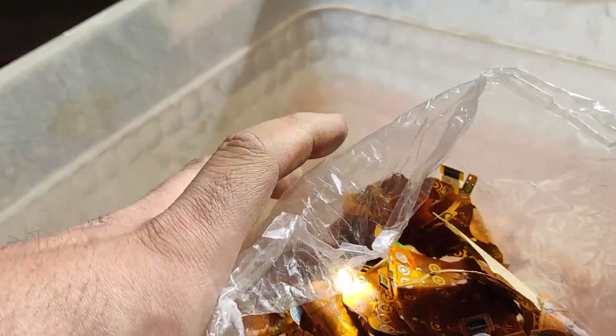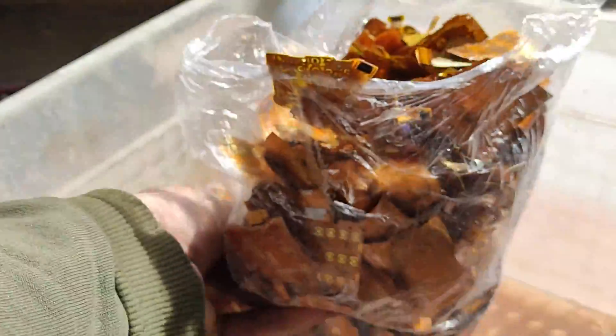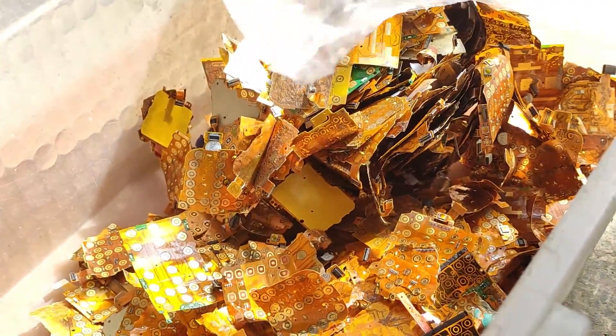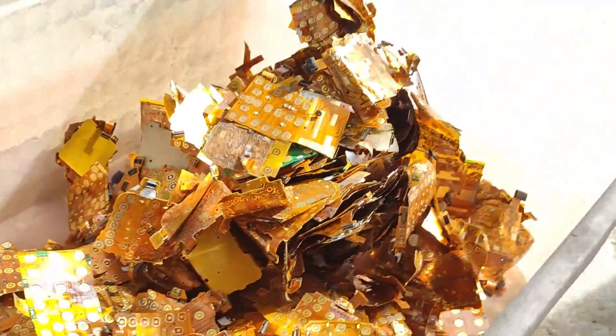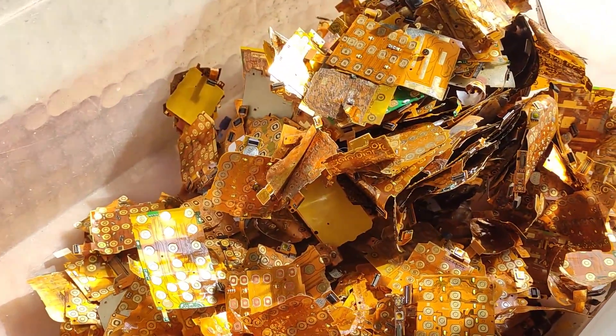Hello refining enthusiasts, today I will be working on extracting gold from cell phone flex touchpads. This material has consistently provided misleading data, prompting me to personally delve into the process to uncover the truth. I've gathered about half a kilogram of this material.